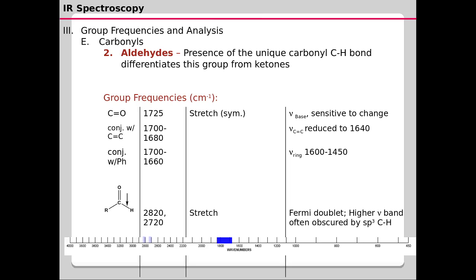We shall first start with aldehydes, one of the most popular types of carbonyl compounds we know about. For aldehydes, except the carbonyl functional group, the rest of the molecule usually gives spectral features that are characteristic or unique to the hydrocarbon framework of the rest of the molecule.